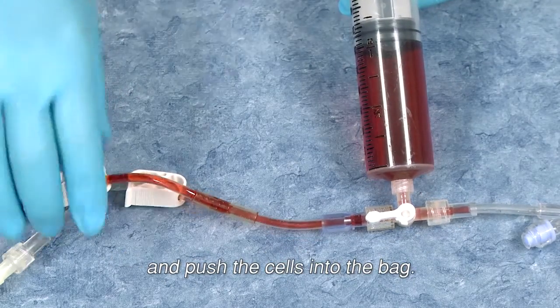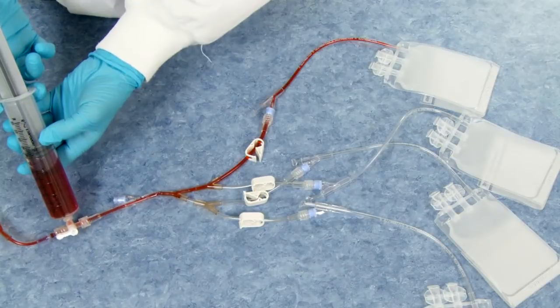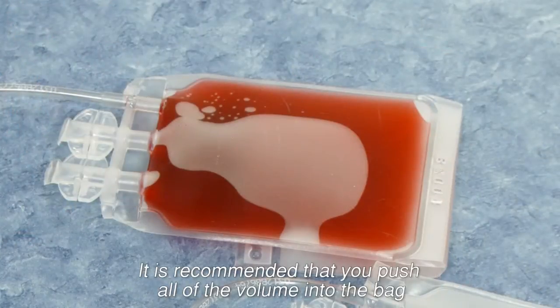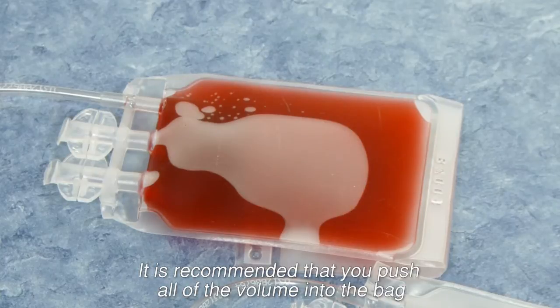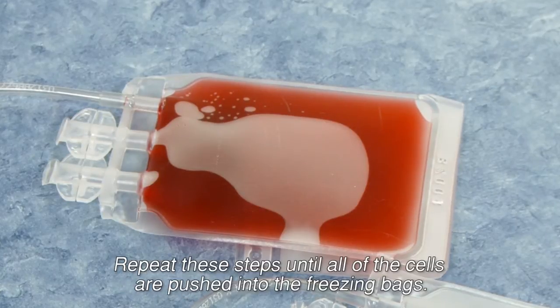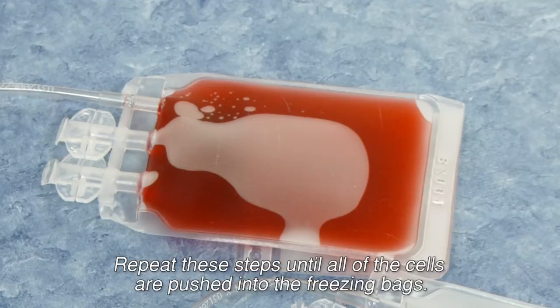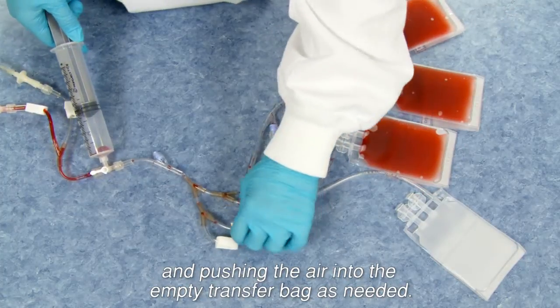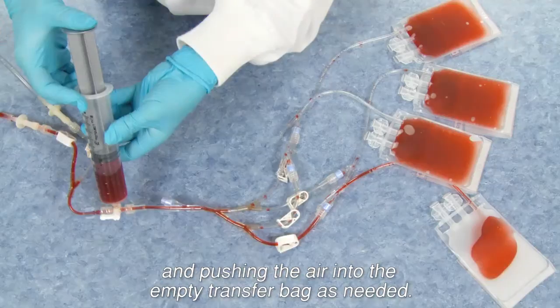Move the stopcock to the open position of the Cryostore freezing bags. Open the pinch clamp and push the cells into the bag. It is recommended that you push all of the volume into the bag, leaving the tubing empty at this point. Repeat these steps until all of the cells are pushed into the freezing bags. You can pull the air from the freezing bags by reversing the process and pushing the air into the empty transfer bag as needed.